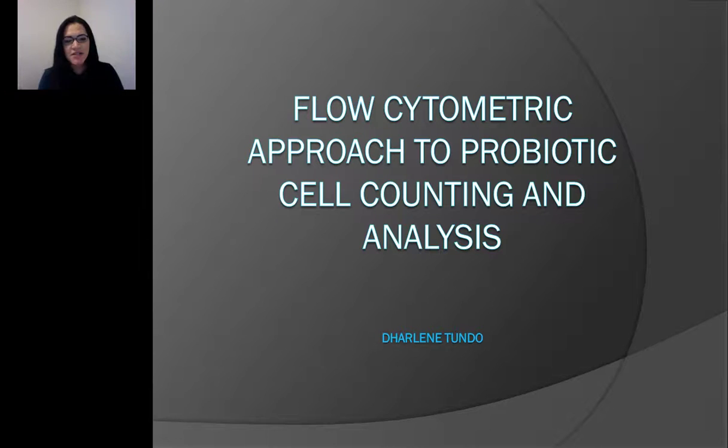Thank you very much. Like I said, today we are going to be talking about the flow cytometric approach to optimize the traditional method, which is plate count, mostly used by all microbiologists to determine the viability of probiotic cells.